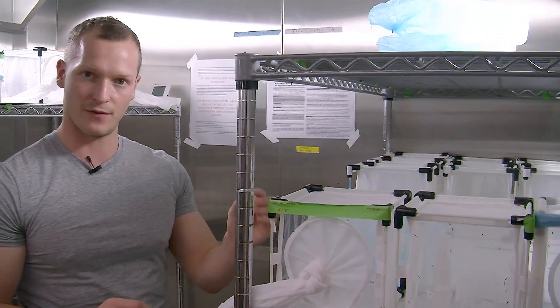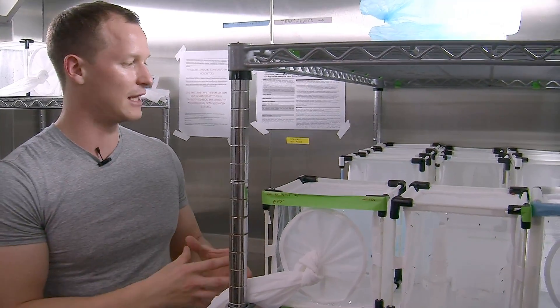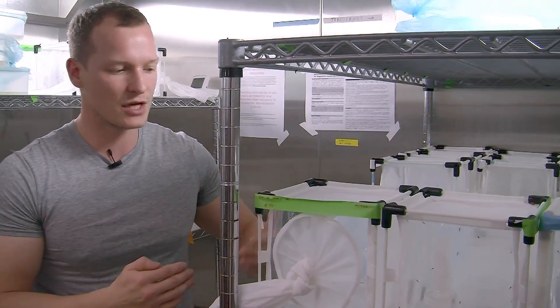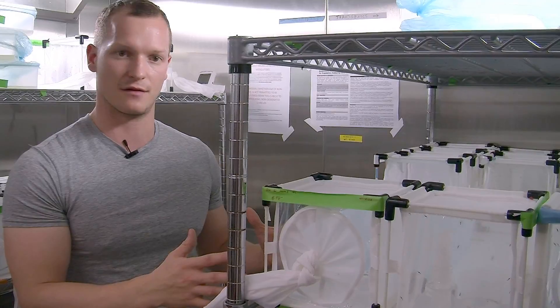We take just a couple of our gene drive mosquitoes with maybe a thousand wild mosquitoes and monitor it generation by generation, screening how many contain the gene drive — looking for this red fluorescent protein — and how many don't. What we see is that each generation the gene drive increases in frequency, and a higher and higher proportion of mosquitoes in that cage become our modified mosquitoes.